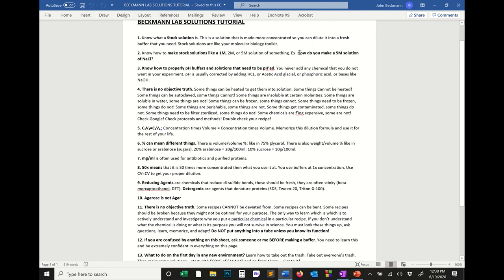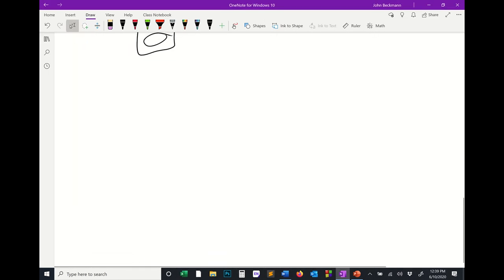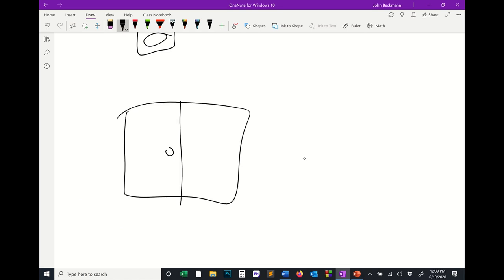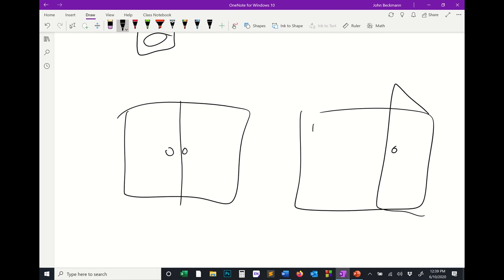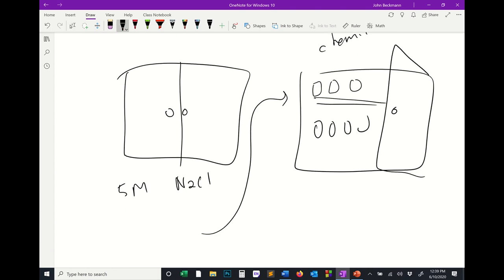So how do you make a solution? Well, let's do an example. How do you make a 5-molar solution of sodium chloride? Okay, now in the lab, how do you do this? The first thing that you do is in the lab, somewhere there's going to be a cupboard, okay? You're going to open that cupboard, and in that cupboard is going to be some shelves with a bunch of chemicals, okay? So if you want to make a 5-molar solution of sodium chloride, you're going to go into that chemical cupboard, and you're going to find the bottle that says sodium chloride, okay?